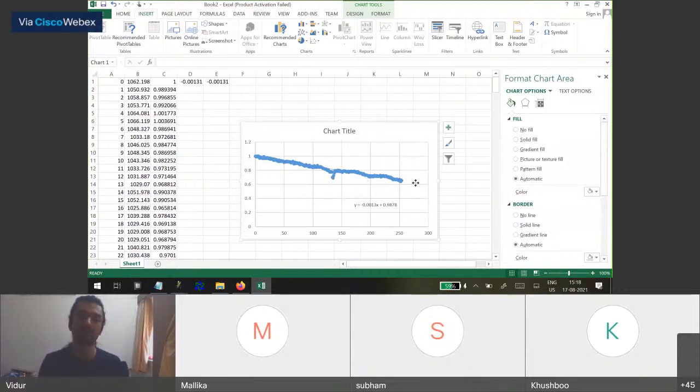However, if your bleach is greater than 50%, you will be forced to go into modeling non-linear kinetics and exponential kinetics, which is a little more difficult. And if someone is interested in that, I can cover that later. Right now, I'm considering the ideal case where your bleaching is still in the linear range.